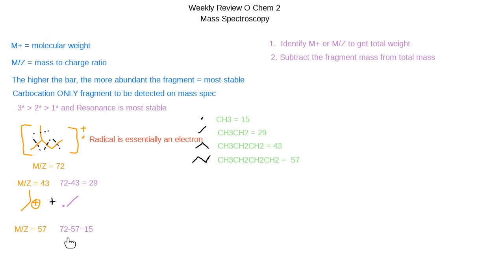Okay, and luckily we already went over all the different ways we can cut to get exactly one methyl group out. But we have 3 different options. Okay, and that is why the carbocation and radical come into play, because we have to pick the most stable cleaving. Okay, because most stable means more abundant fragment, which means a higher bar. So mentally do this in your head.